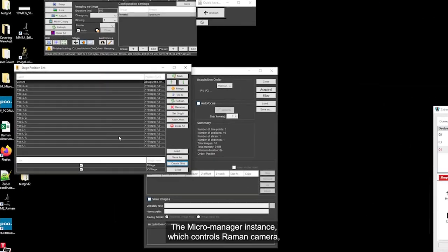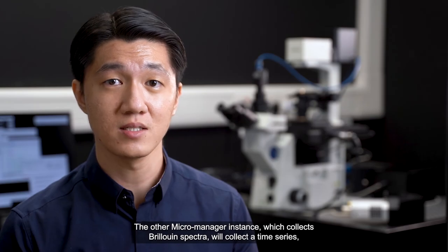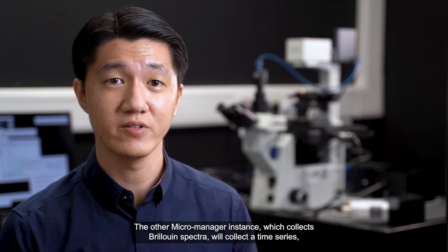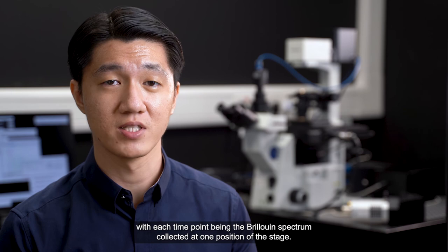The MicroManager instance which controls the Raman camera will control the stage and do the raster scanning. The other MicroManager instance, which controls Brillouin spectra, will collect a time series with each point being the Brillouin spectrum collected at one position of the stage.